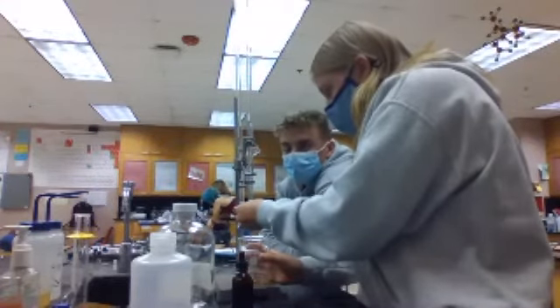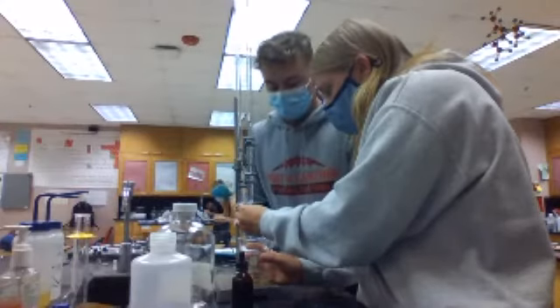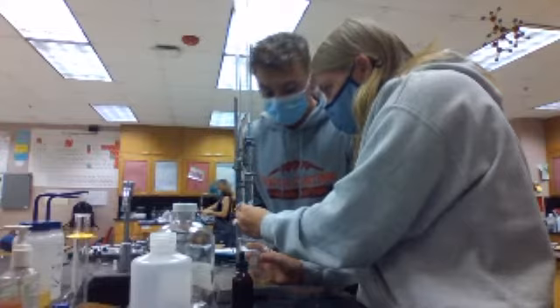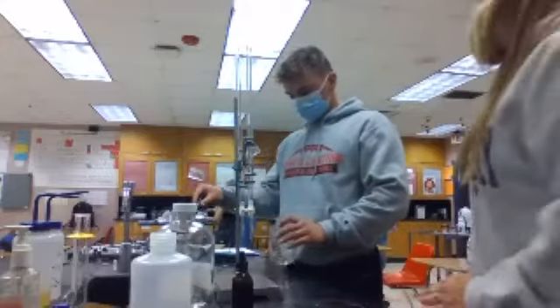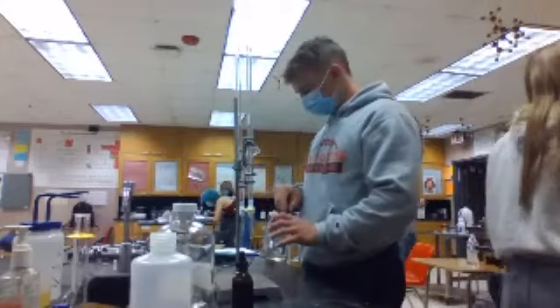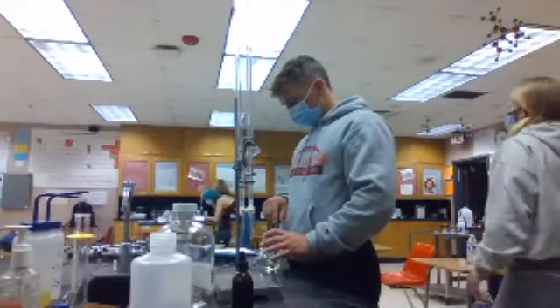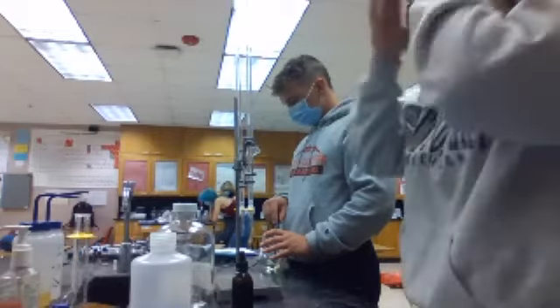Okay. Watch for blue. And then I'll give you guys the... Do one more full milliliter. The molarity of it should be 0.8393. I put a value in with no y, so it would be higher. Don't worry, you'll do it tomorrow. Should we just stop? I gotta make a more concentrated base. Well, I don't know how to do it. He's giving it 1.94.